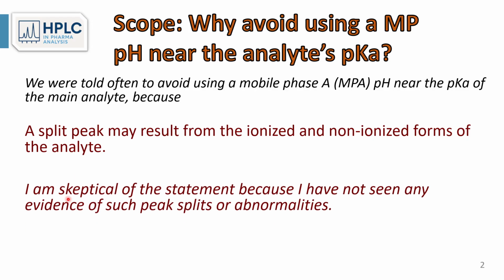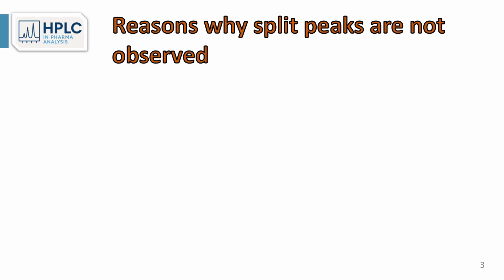I'm very skeptical of this statement because I have not seen any evidence of such peak split or peak abnormalities. I'd like to enumerate the reasons why split peaks are not observed.